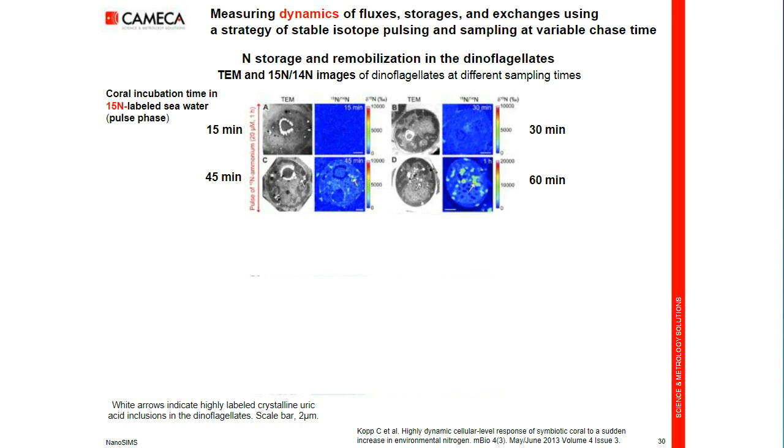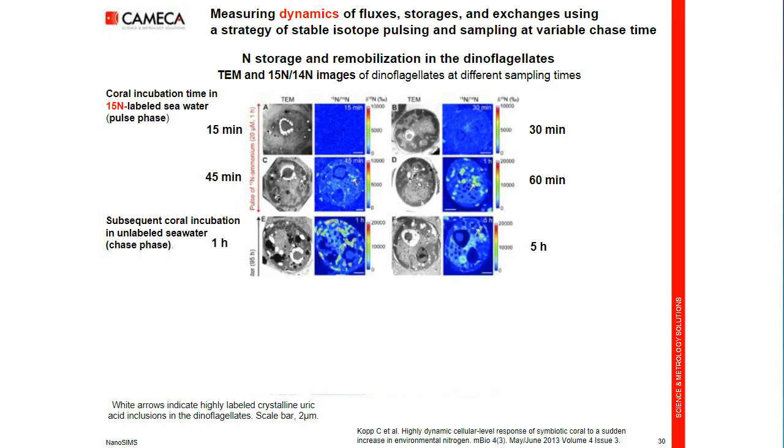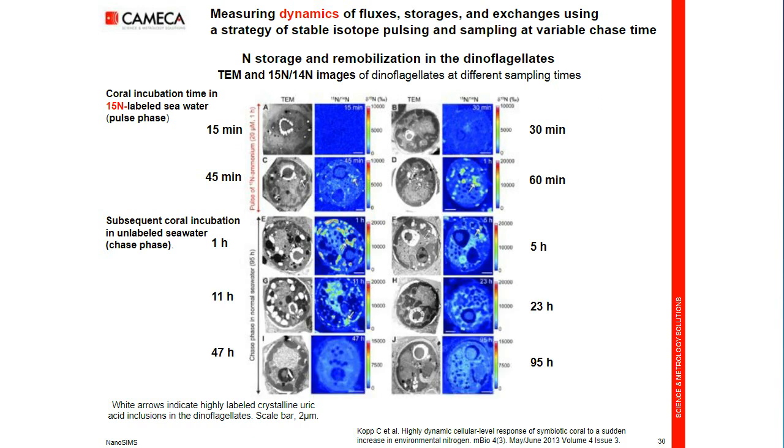Then in the chase phase, so the rinsing with normal seawater, it's possible to see the remobilization, 1 hour, 5 hours, 11 hours, 23, 47, 95 hours of remobilization of nitrogen from the storage into the main tissue of the dinoflagellates. So this strategy is a general strategy in life science of a pulse-chase experiment with sampling at various times of the experiment.